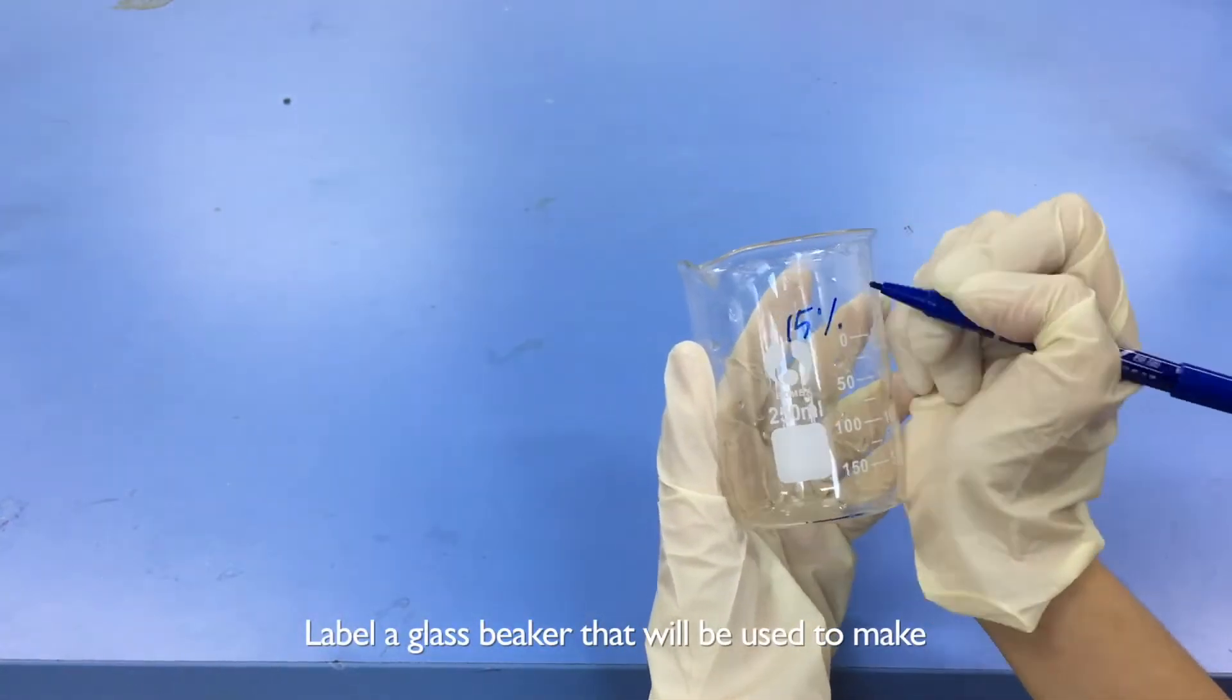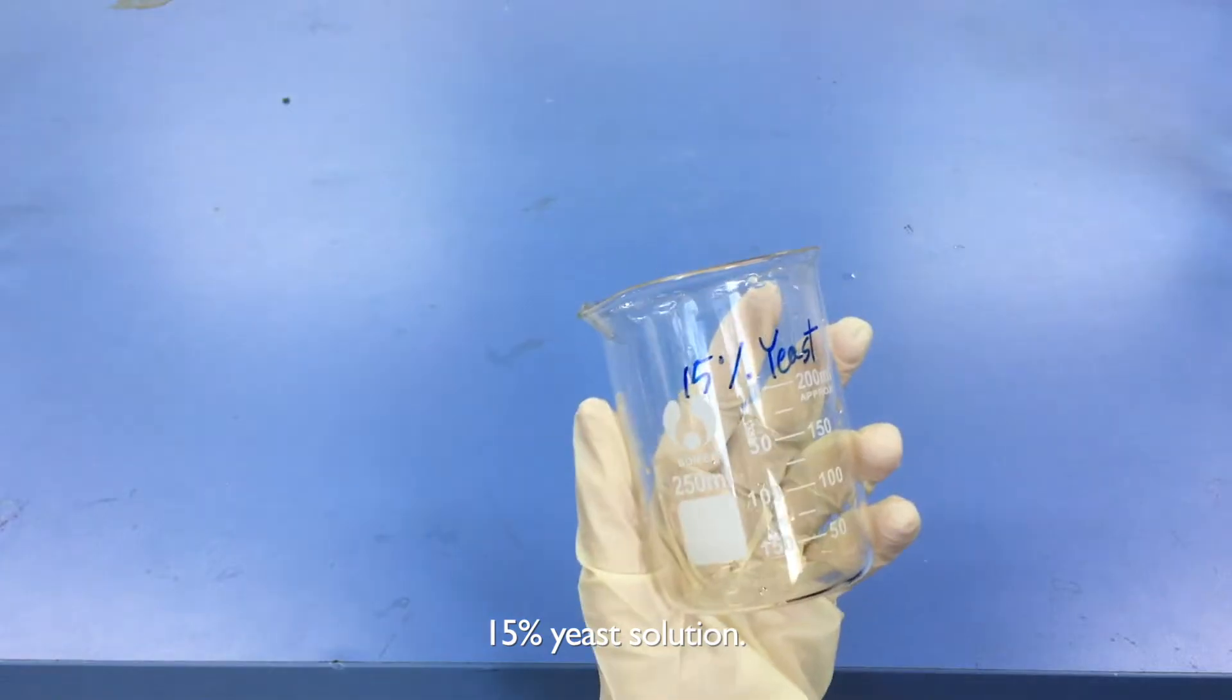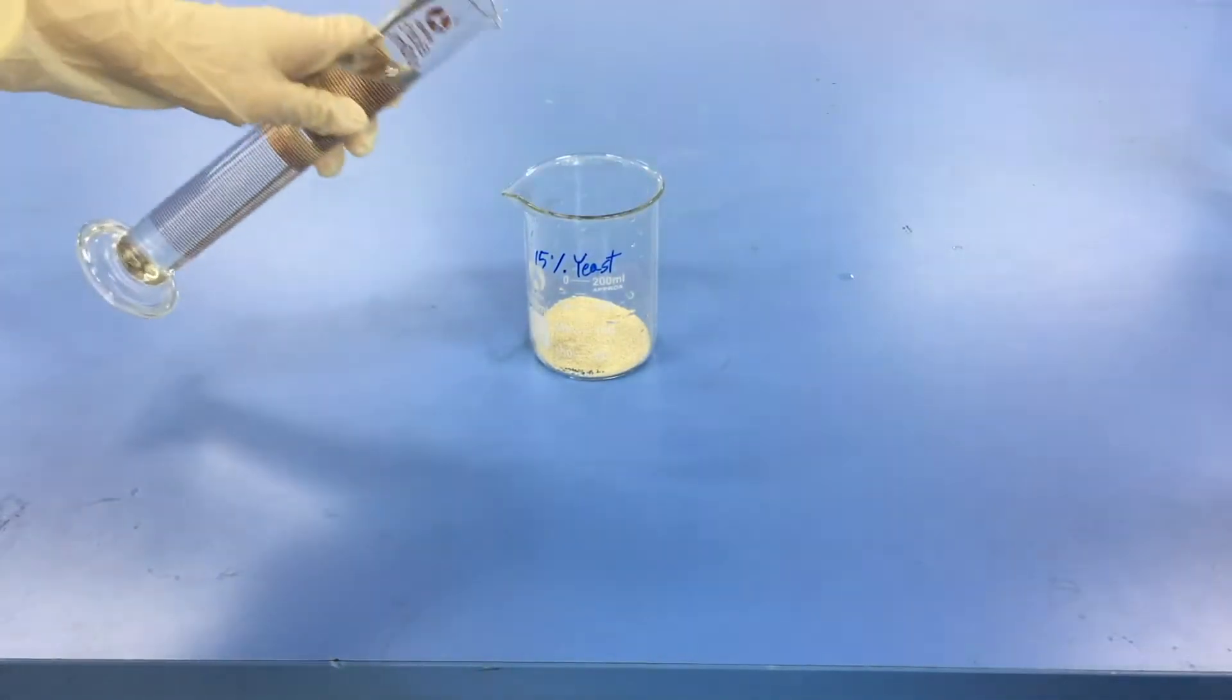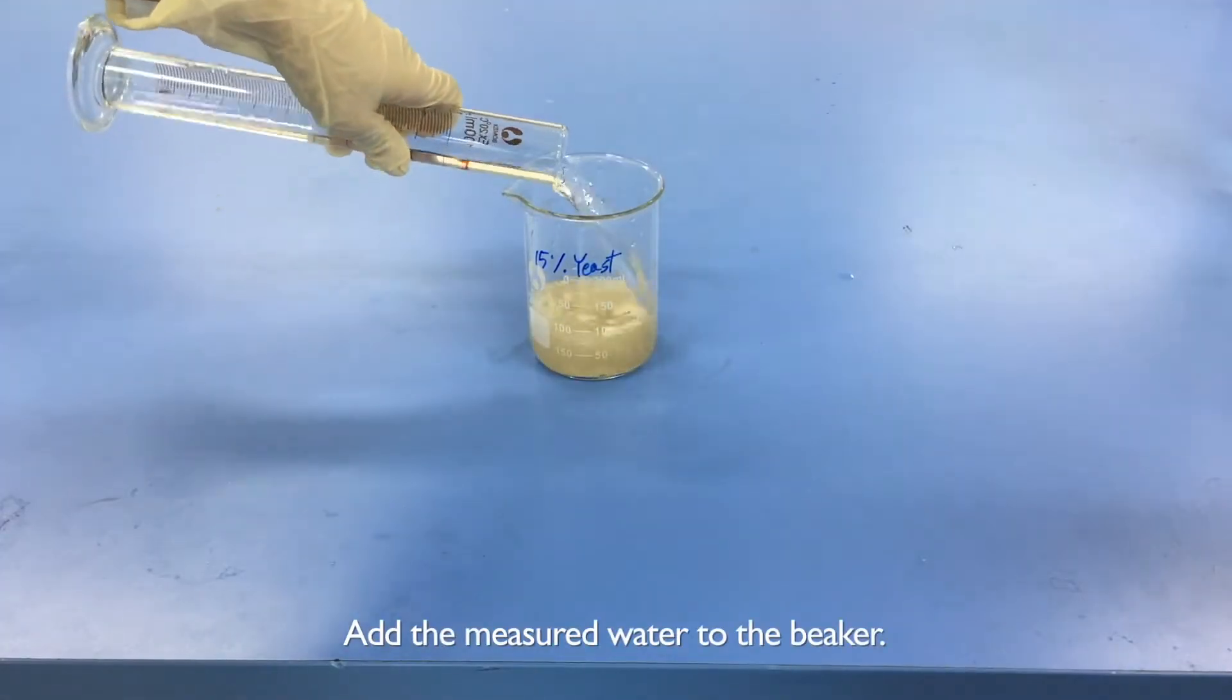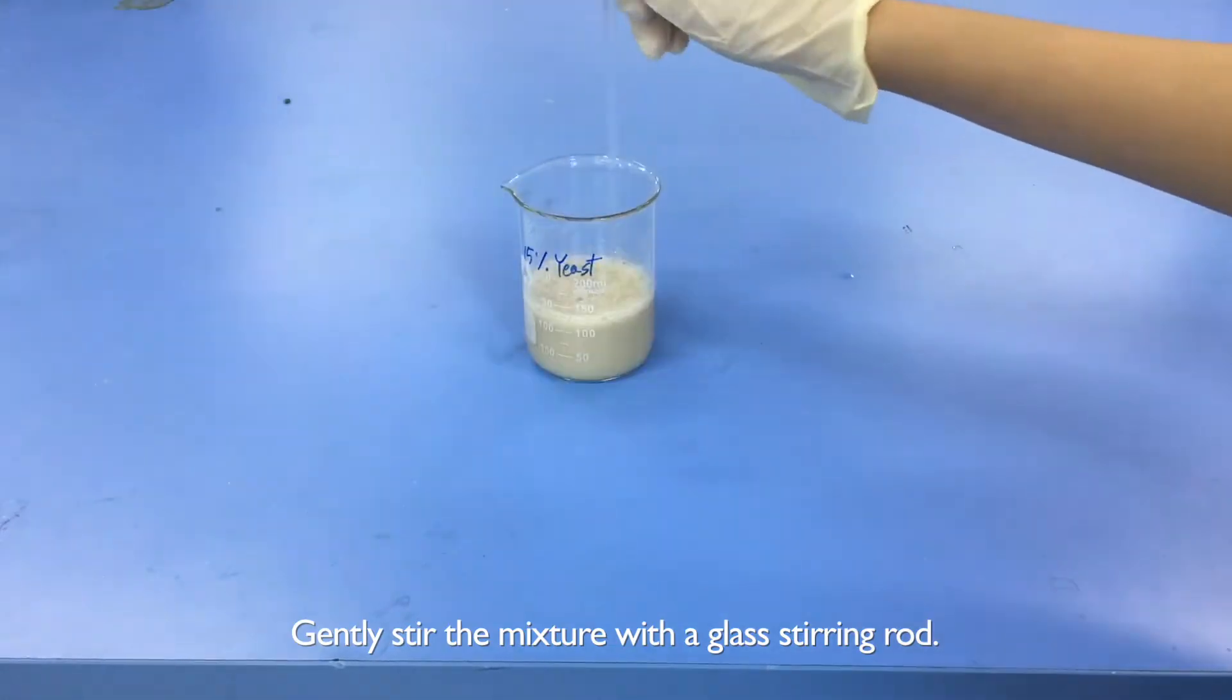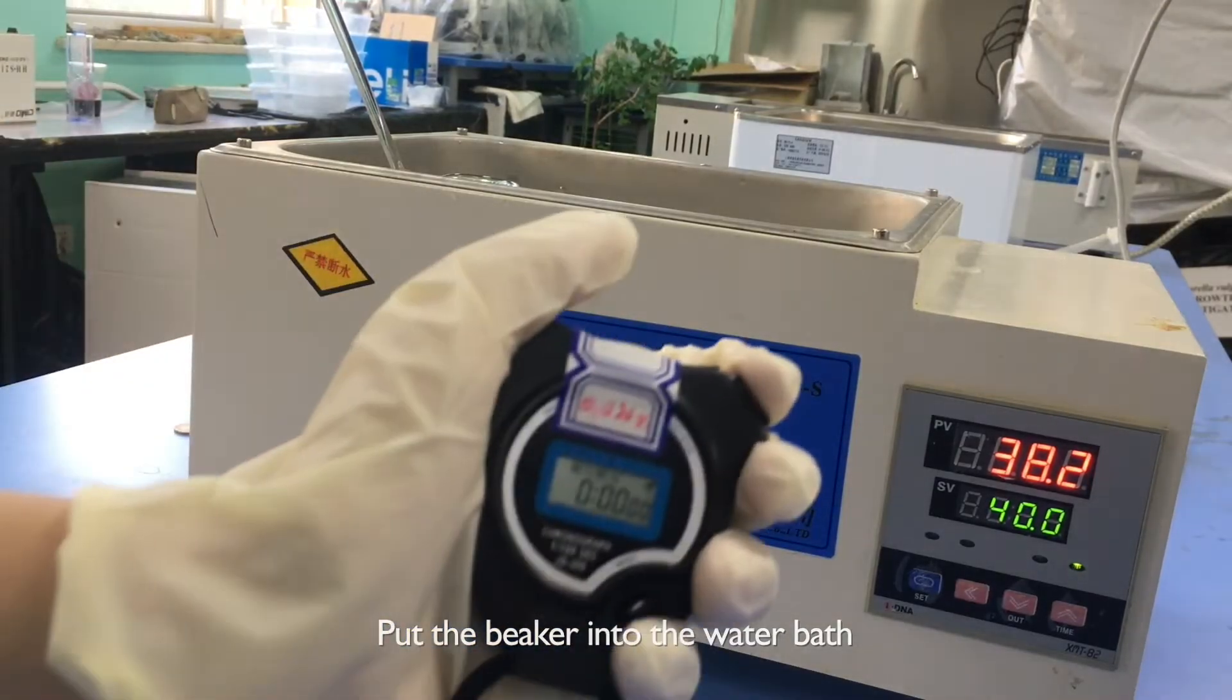Label a glass beaker that will be used for the 15% yeast solution. Pour 15 grams of instant dry yeast into the glass beaker. Add the measured water to the beaker. Gently stir the mixture with a glass stirring rod. Put the beaker into the water bath.